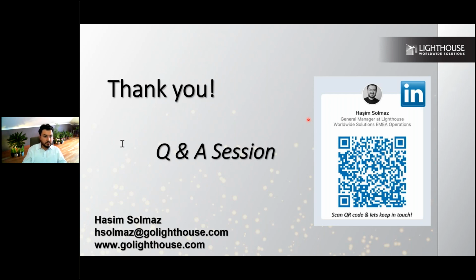Most welcome. Can you explain about relation with the filter HEPA and laminar flow? Okay, I think the question is about the connection between HEPA and the laminar flow.